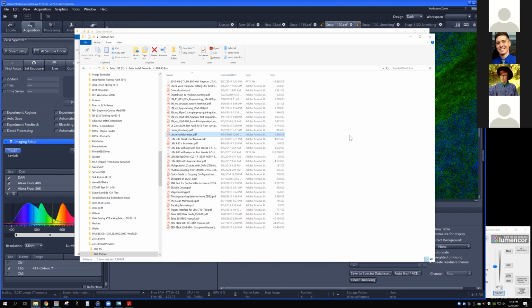I do need to spend a little bit more time with you on the camera, but I think I'm going to leave that until tomorrow. I did get it working at least, so that's good. And then we did some confocal imaging, working through loading a configuration, and spent a lot of time in the afternoon on how that image setup really works and impacts your image quality, working with the balance between lasers and PMT, and also optimizing the image using the frame size, the averaging, the dwell time, and so forth.